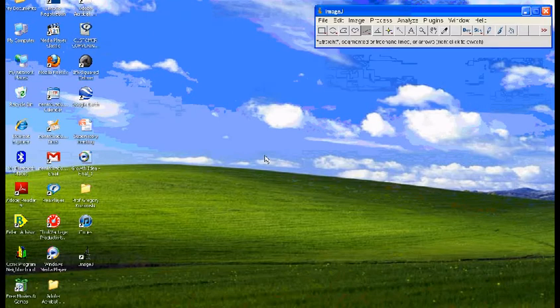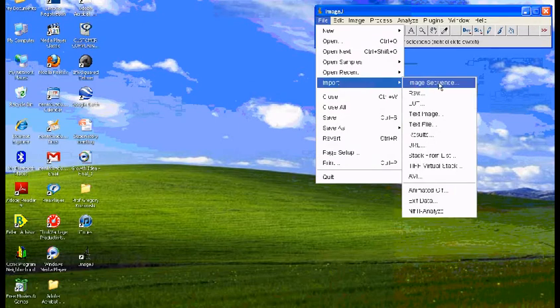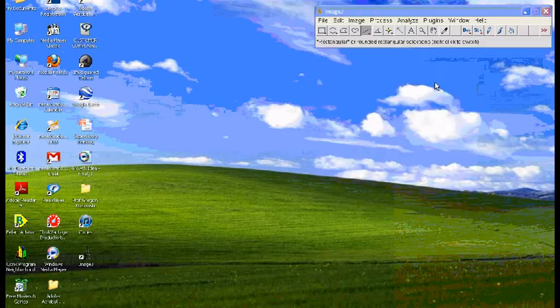Now this ImageJ software is intended for measuring any length or area according to pixel. So if you want to measure anything, you need to have a source file. So where are you going to get a source file? You need to import it. So I will go to File, Import. You have lots of choices: image sequence, your raw file, and so on and so forth.